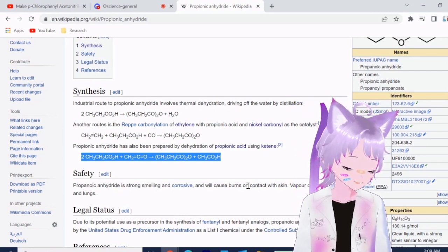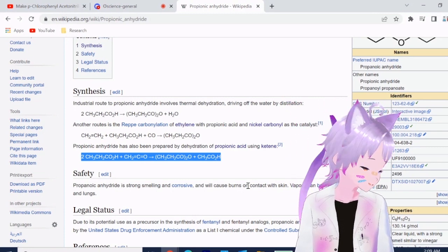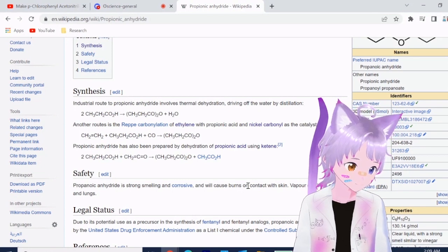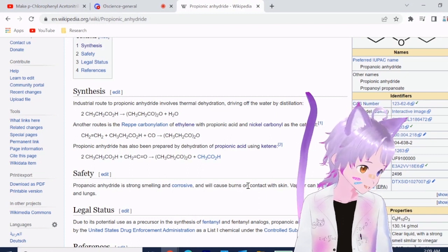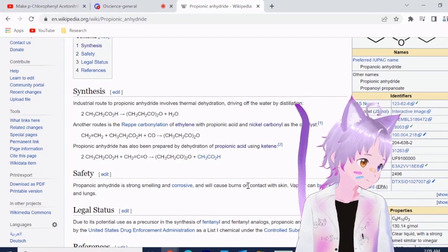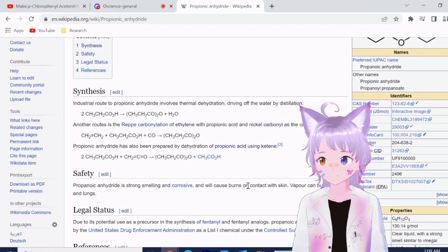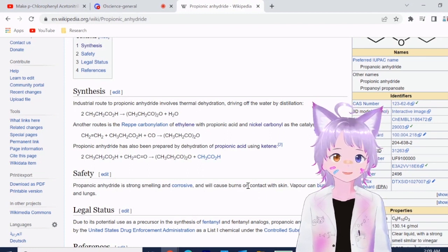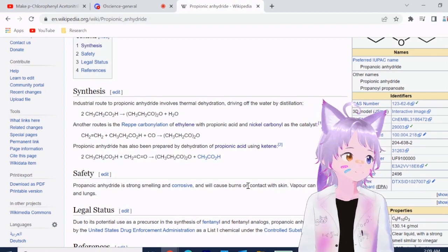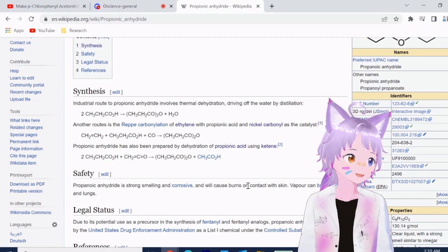Yeah, I wanted to do it, but man, do it outside, with scrubbers and manometers. If you don't have at least three of those things set up correctly, I would not. Those manometers are your lifeline, basically, because they will tell you whether or not the main thing is operating at positive pressure, neutral, or negative pressure. You want it to be slightly under neutral. You know what that means? If you're at slightly under neutral pressure, it means that if you do have a leak, instead of ketene going out, air will go in, which is better. Of course, you can't have too much air because you do have a lamp in there too. But still, it's safer than dying. So you let the scrubbers deal with it. Yeah, man, it's safer than dying.